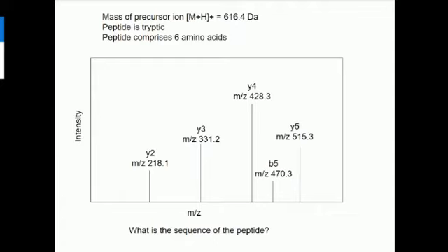Now the charges cancel each other out, but if you're going to subtract the B5 from the intact, you need to take into account the N-terminus and the C-terminus. Okay, so you've got, what is it? So the 18 is from the hydrogen at the N-terminus and the OH at the C-terminus. And that should give you 128.1. Yeah, and that tells you that we've got lysine here.